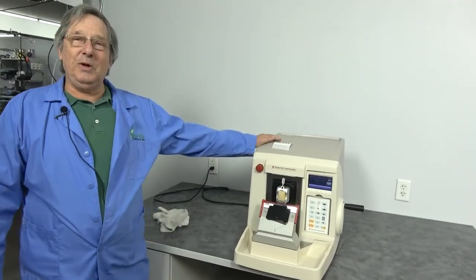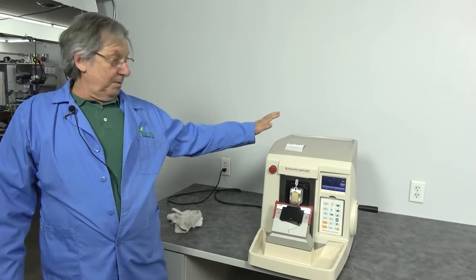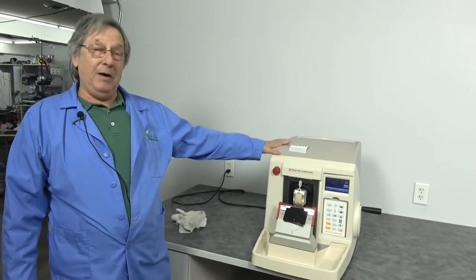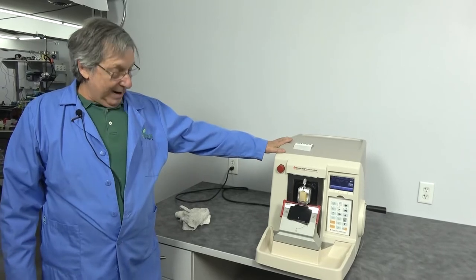Hello, welcome to New Life Scientific. My name is Steve. Today's video is going to be about the Sakura TissueTek auto section microtome.